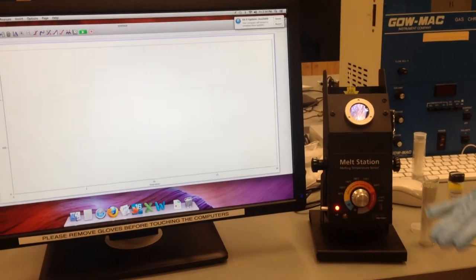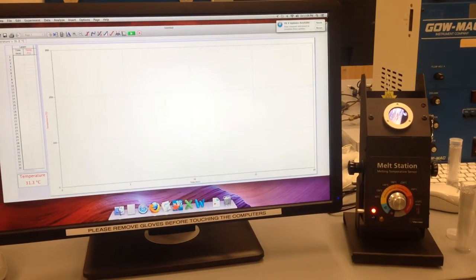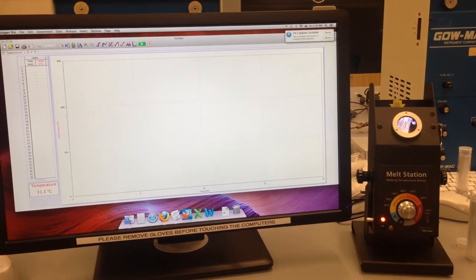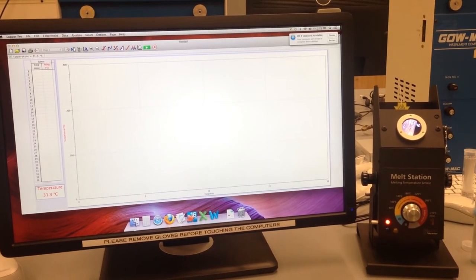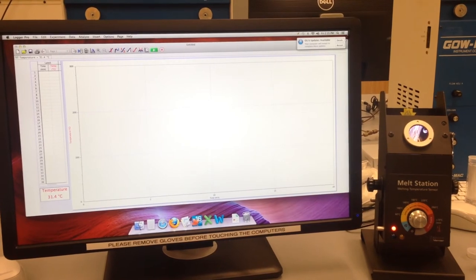Adjust the dial so that it raises the temperature 7 to 10 degrees Celsius per minute. If you know the approximate melting temperature of your substance, you should decrease the rate of the increasing temperature to 1 to 2 degrees per minute once you reach a threshold area. If you don't know the expected temperature range, take a crude melting point and then repeat the experiment.